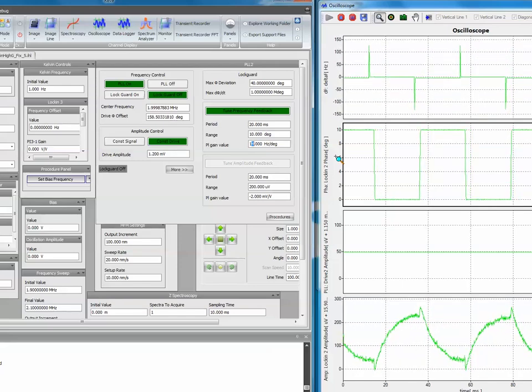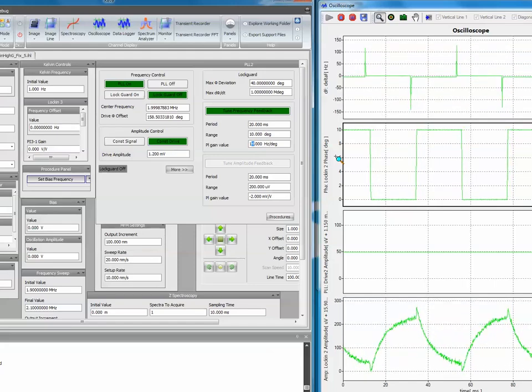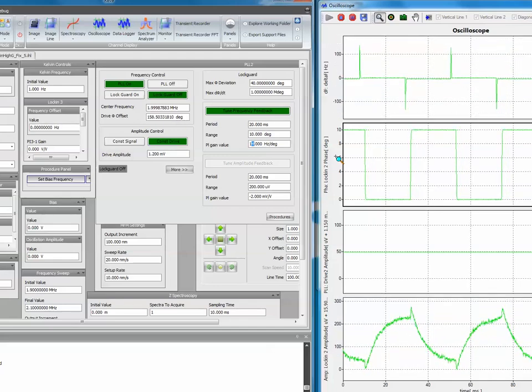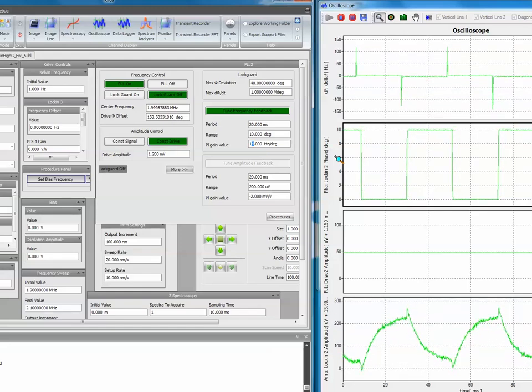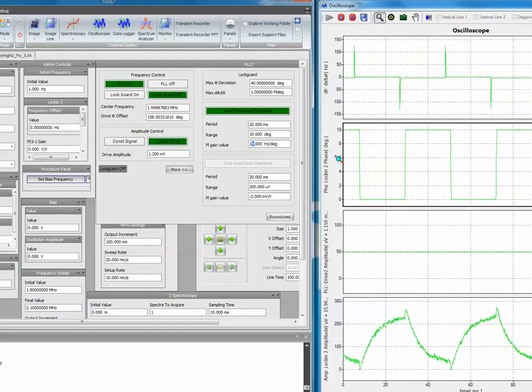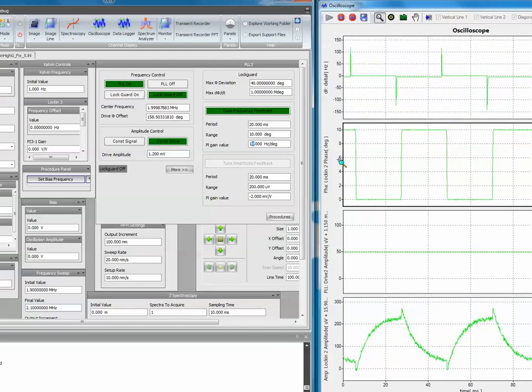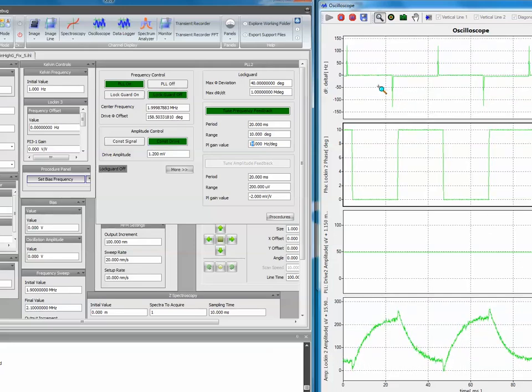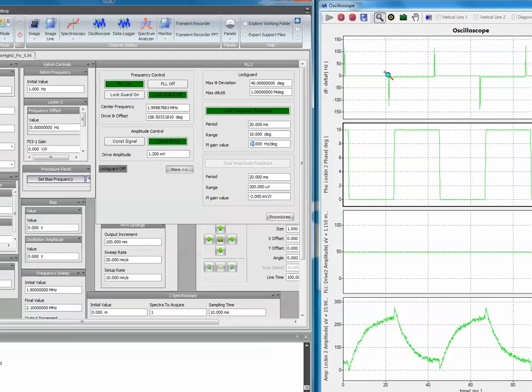Now, with this PI controller, we're commanding the receiver phase to be at the detected phase, at the drive phase, or behind the drive phase. So in order to catch up, the frequency on the drive needs to speed up, and in order to go behind again, the frequency needs to slow down. So that's what creates these peaks. The peaks are not really a measurement effect, they're mostly an artifact of what we're doing here.